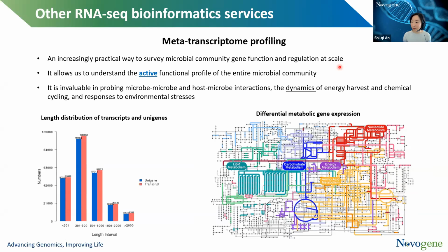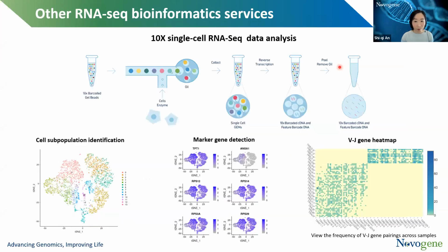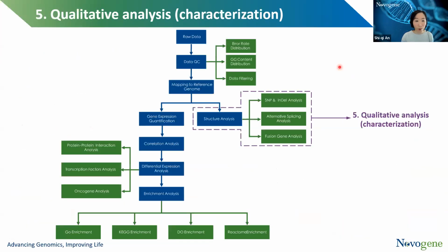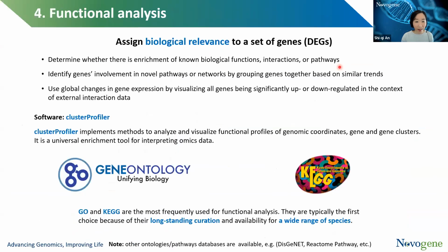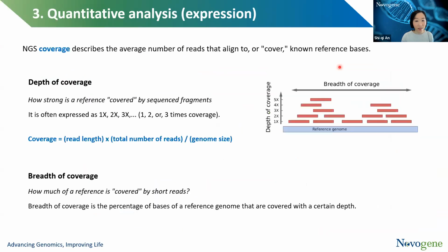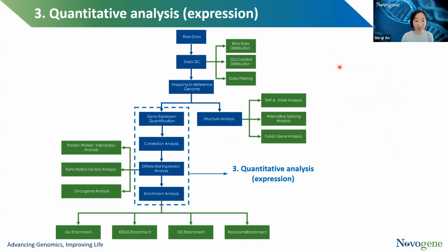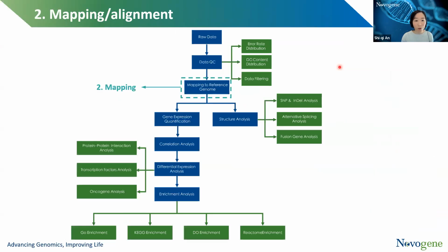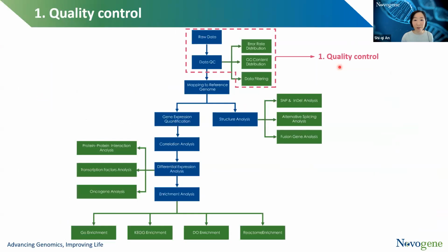Yeah. Thank you. We have Anna who is asking if it is possible to carry out total RNA sequencing from FFPE samples. Yes, it is possible. However, FFPE samples usually are highly degraded.